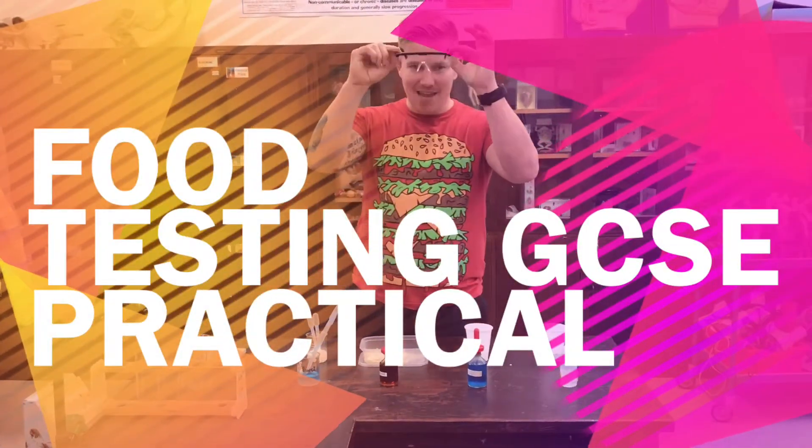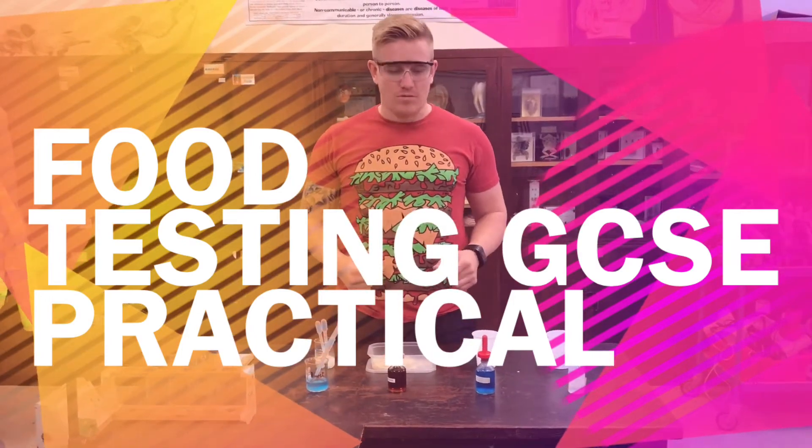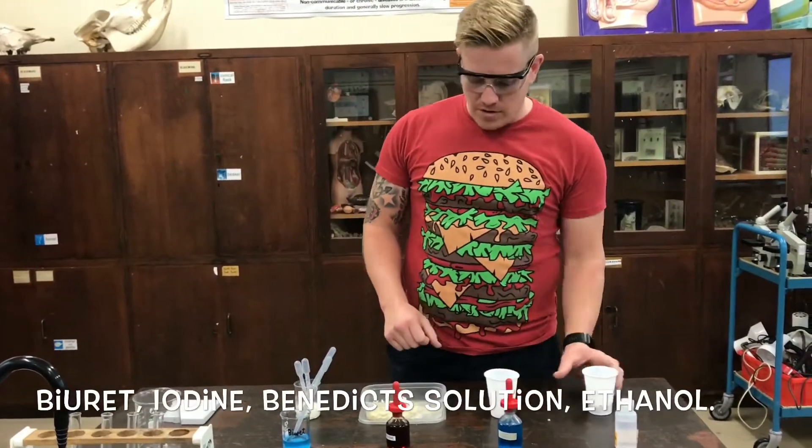Hi, welcome back. As you can see, safety is our number one priority today, so make sure you get these goggles on. We're using some chemicals today and we're going to test some foods. This is part of the required practical for food testing.